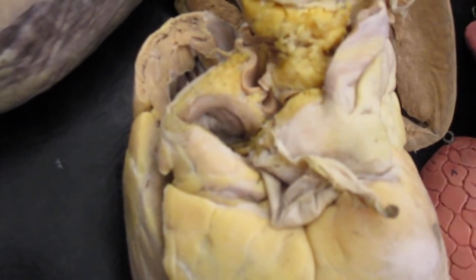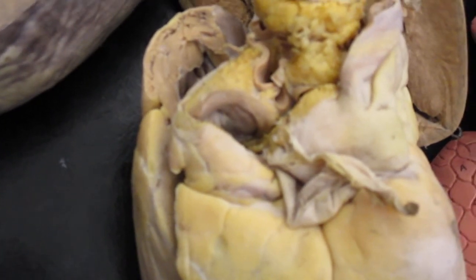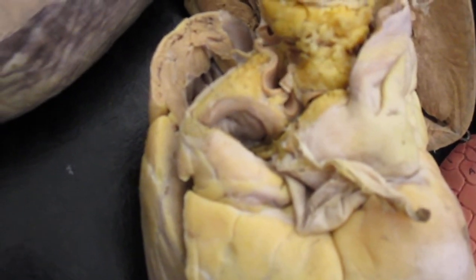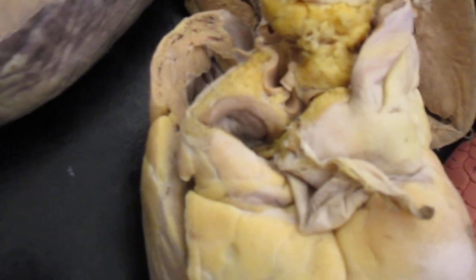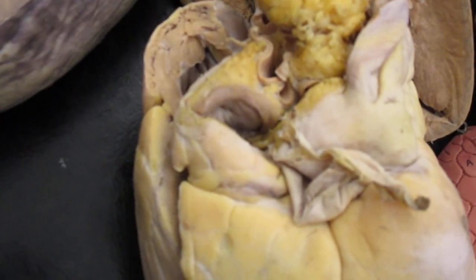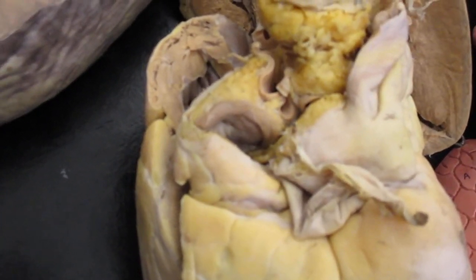Pulmonary arteries carry deoxygenated blood from the right side of the heart, and pulmonary veins carry blood to the left side of your heart, where it's oxygenated blood, and then of course that oxygenated blood is going to go out the aorta.